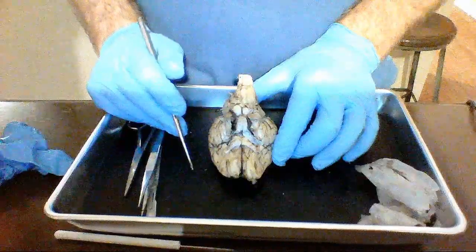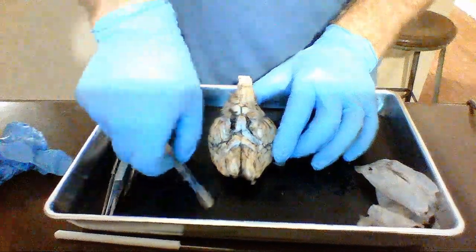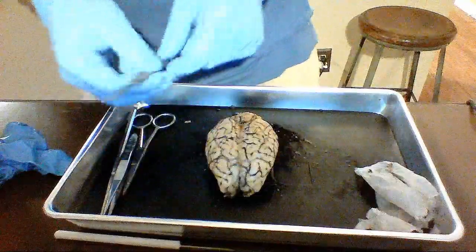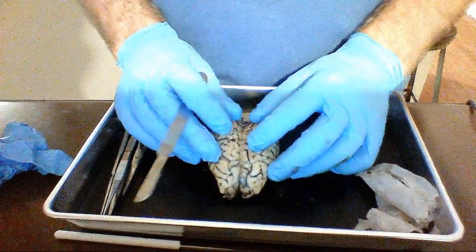Now we're ready to cut in. So what we'll do is we'll do a longitudinal cut down the longitudinal fissure from above. One interesting thing is if you don't start with the scalpel, if you just start to pull apart the two hemispheres, you can see the connection between the two hemispheres.